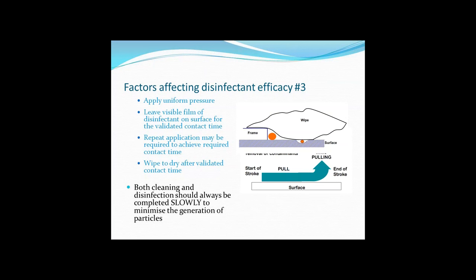Depending on the area, particularly under a unidirectional airflow or in a grade A environment, the disinfectant will evaporate far faster than in a standard clean room. That's always something to bear in mind when carrying out the qualification of the disinfectant. And then there's ensuring that the surface is dry. The converse can happen: an overly wet surface for a long period of time can result in loss of active ingredient and water remaining behind, where it could lead surviving microorganisms to grow. So ensuring that the contact time is sufficient and the surface ends up dry is very important. You can see some examples of different cleaning techniques on the slide there.